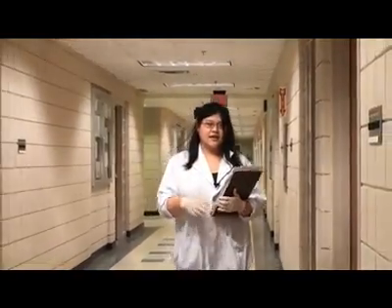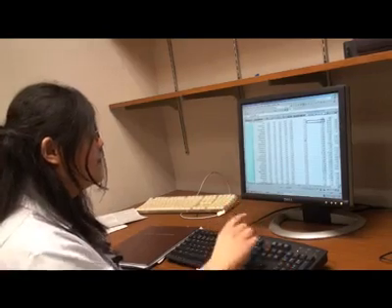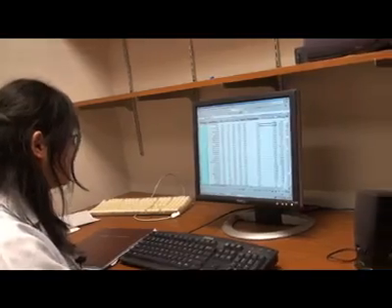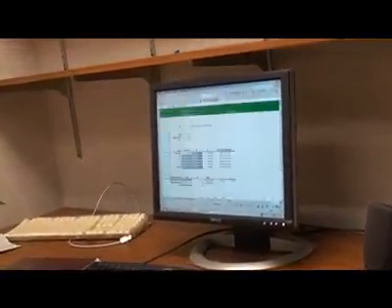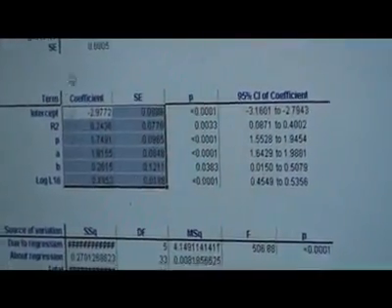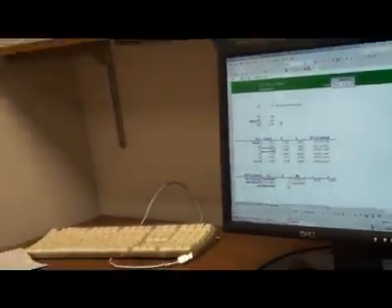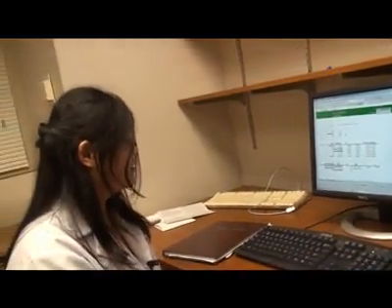Now we can use the Multiple Linear Regression Analysis program to analyze our data and to see the correlation between the solute properties and the retention data of our ionic liquid. After finishing inputting our data into the Excel file, we can use a program called Analyze It to obtain the system constants of the IL that is used to characterize the IL stationary phase. And from this, we can manipulate the data to obtain the retention factor and separation selectivity.